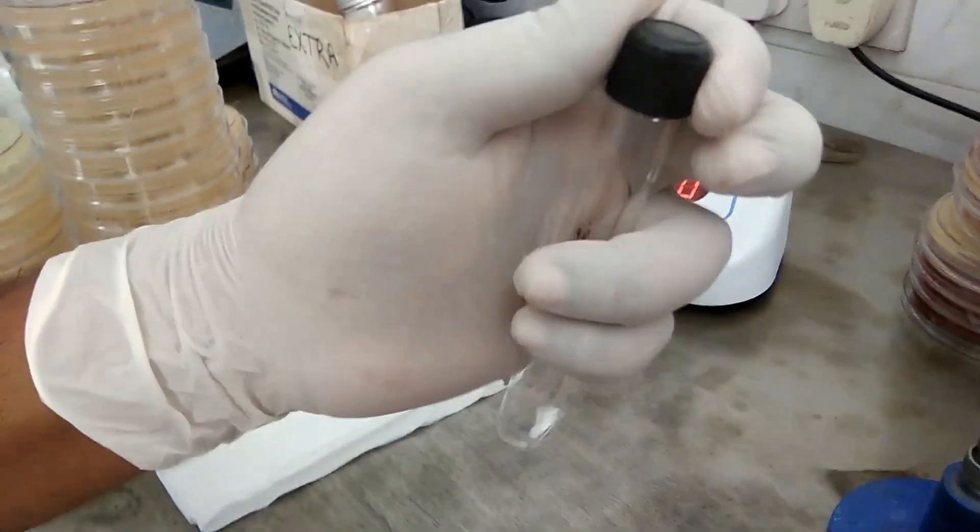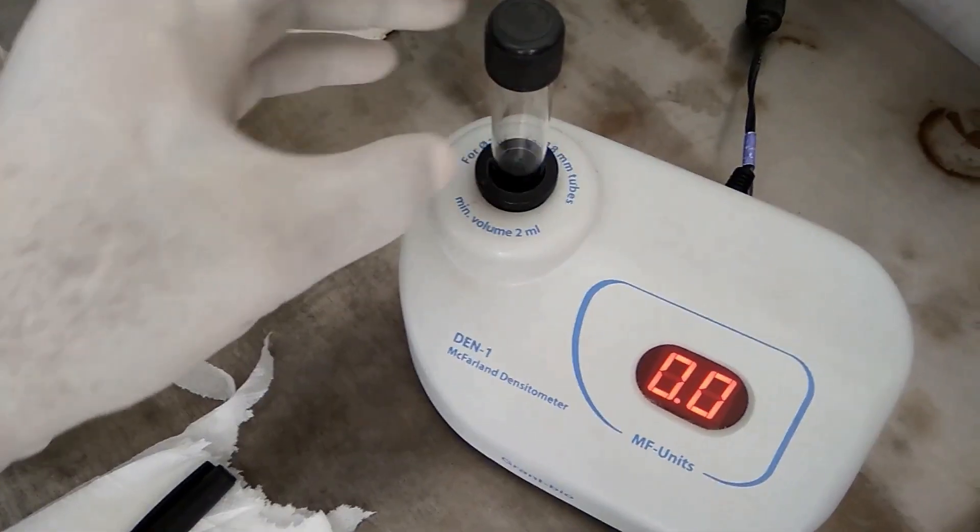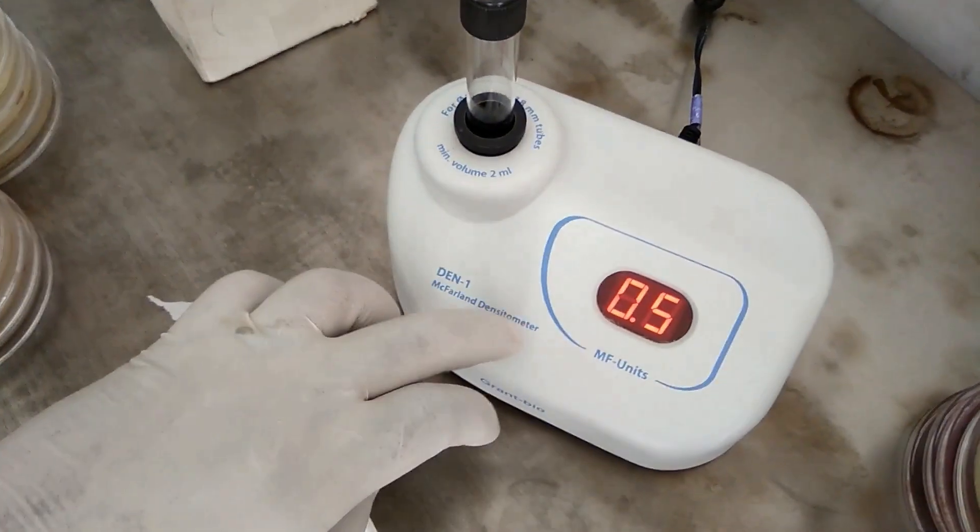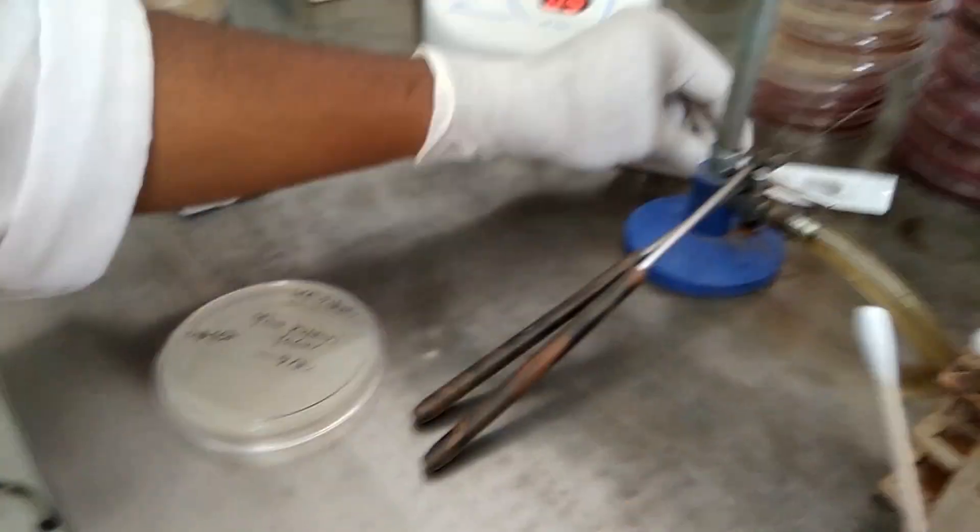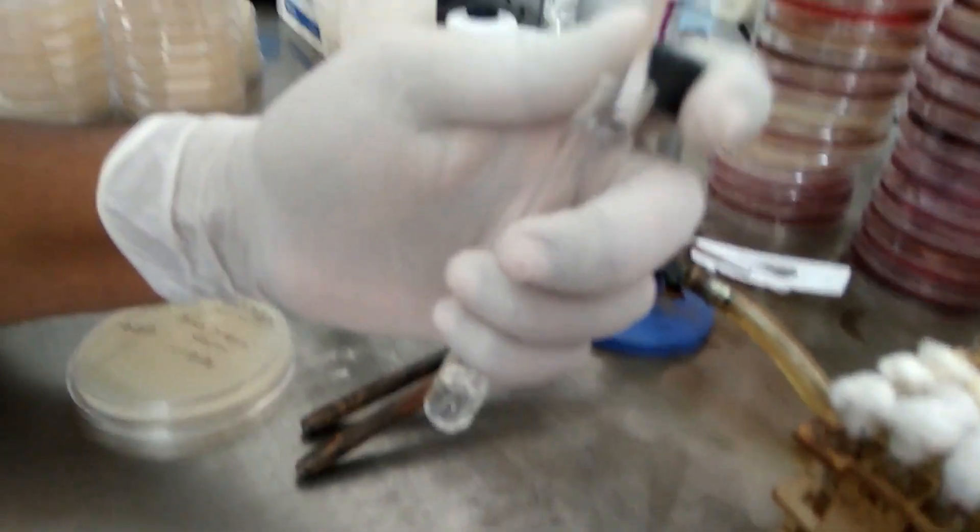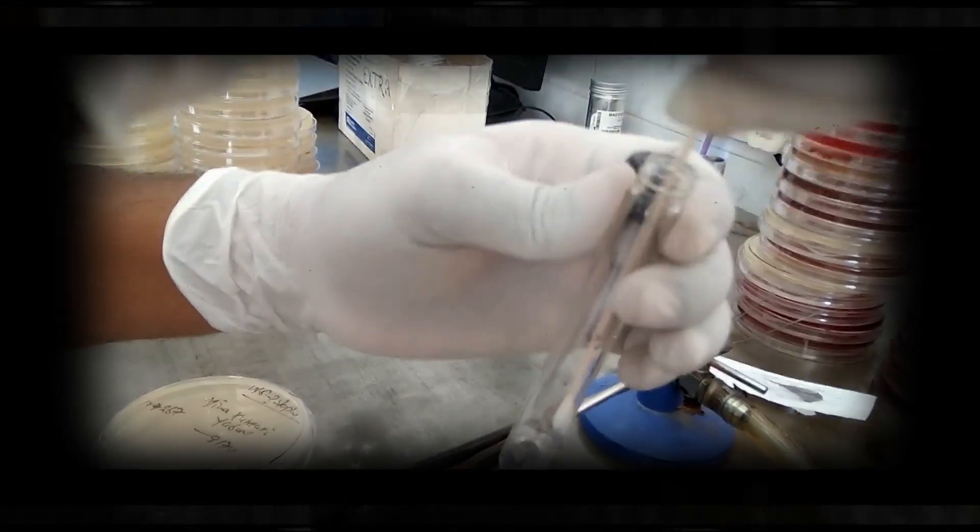It may also be employed for preparation of bacterial antigens and vaccines where a large amount of bacterial growth is required.